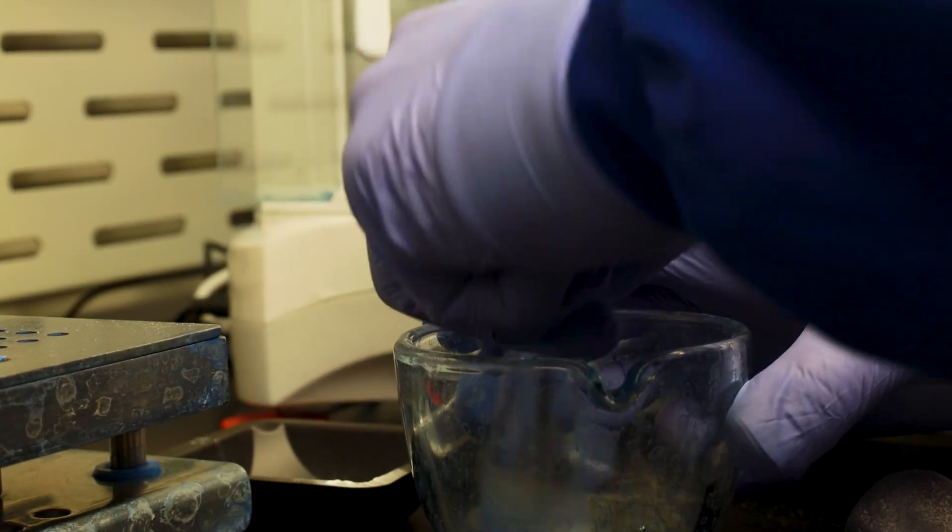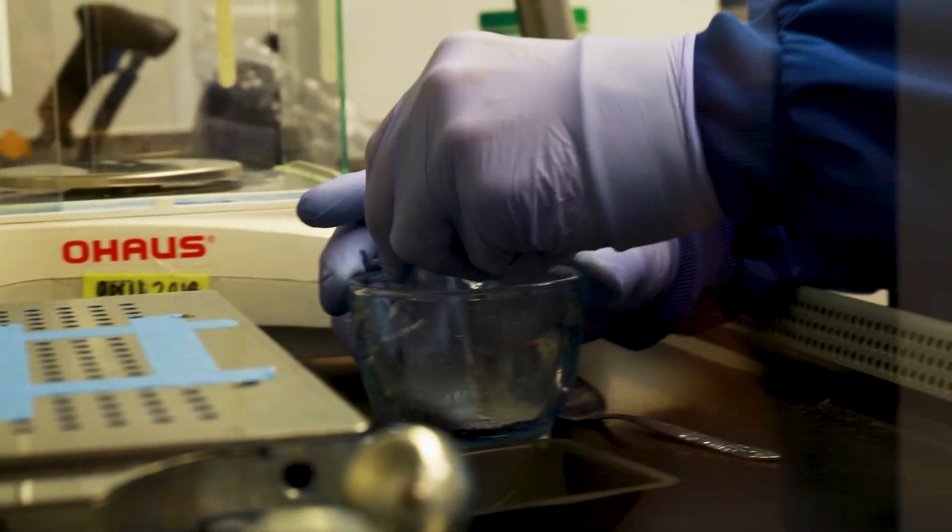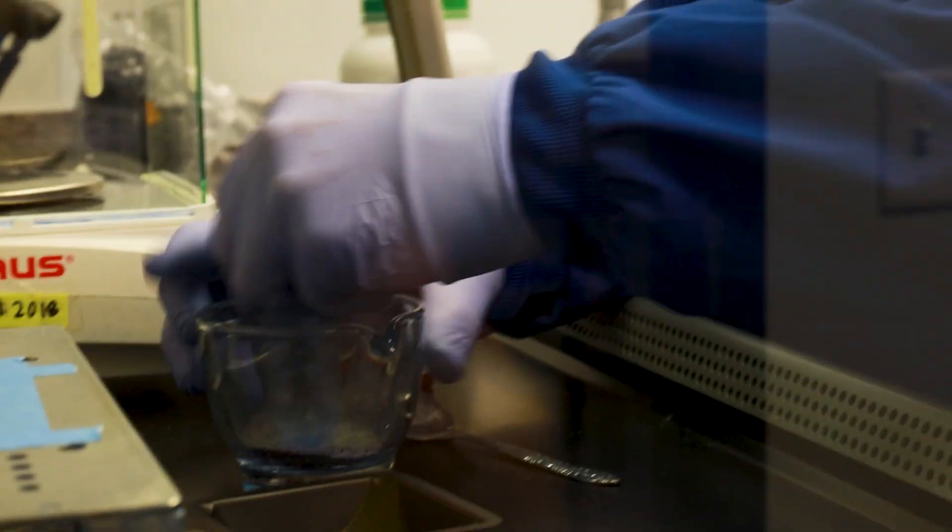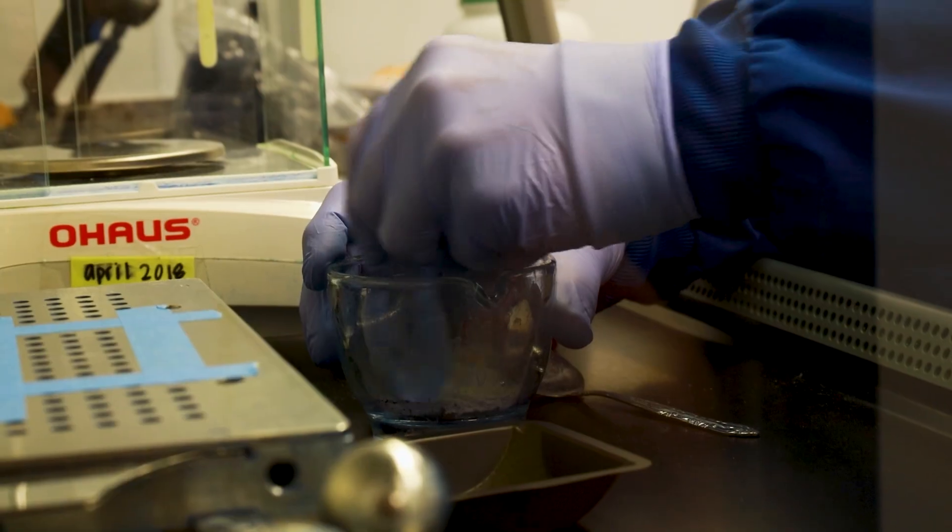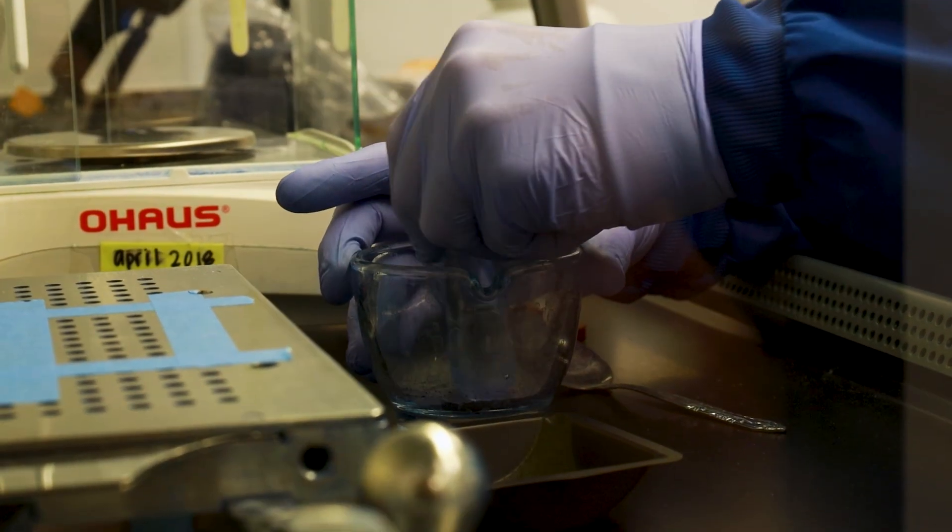So right now we're making methylene blue, I would say about two days a week. And our hope is that more providers learn the benefits of methylene blue, especially for patients with, again, neurodegenerative decline. I feel that this drug can be very helpful for those patients.